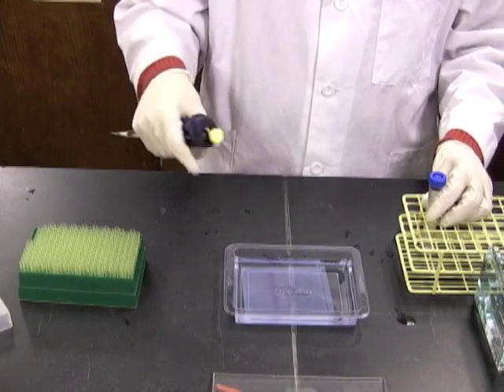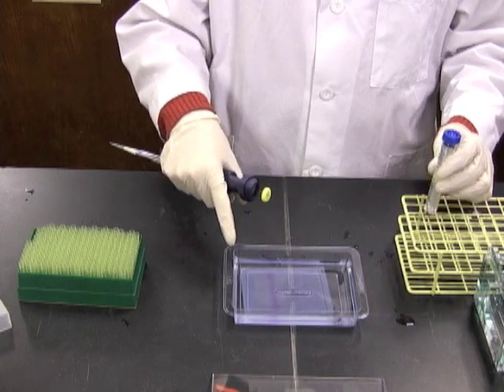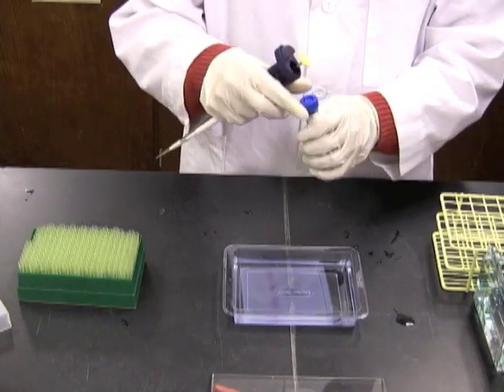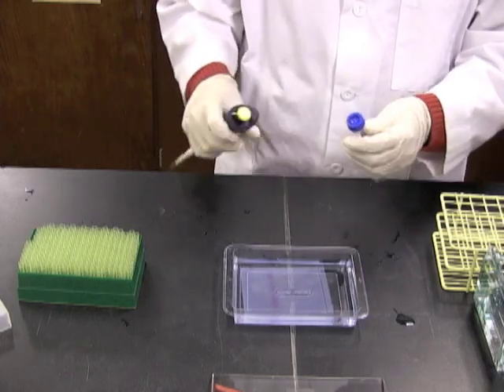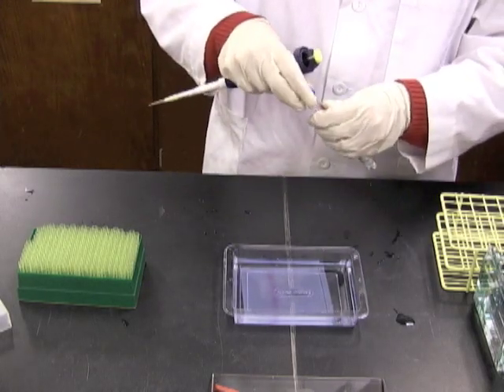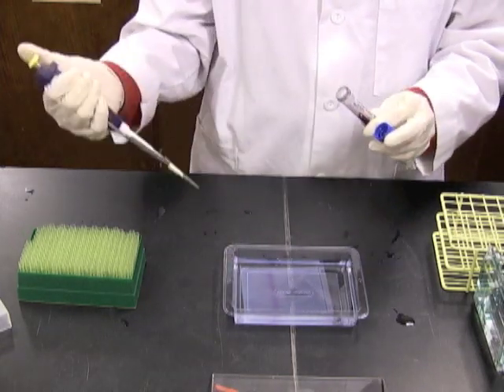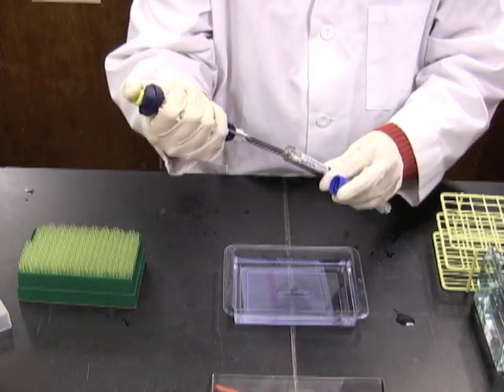The next step is to stain the DNA. I'm going to use ethidium bromide to stain the DNA because it's very sensitive. A good amount to use is to make the final concentration of ethidium bromide in your staining tray 1 microgram per mil.